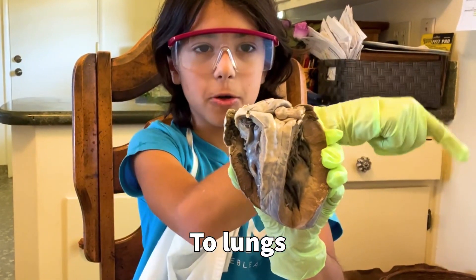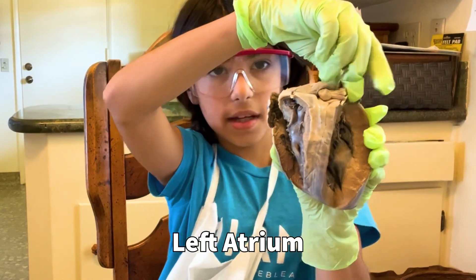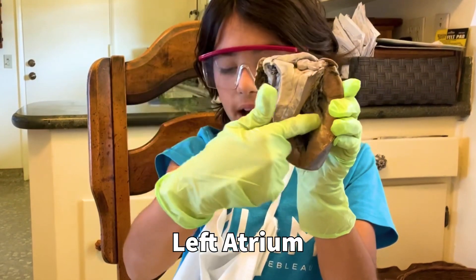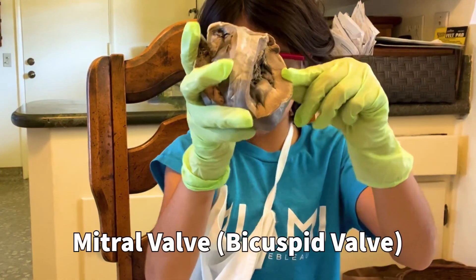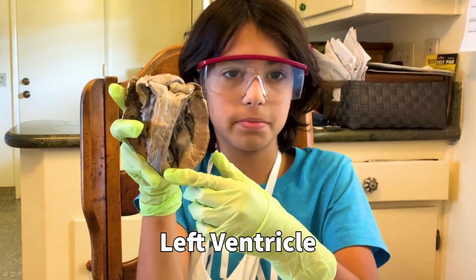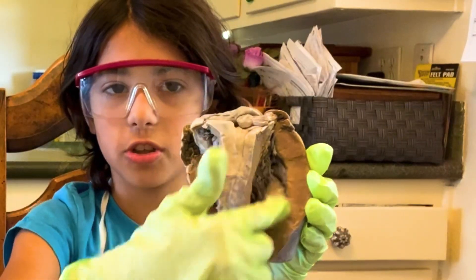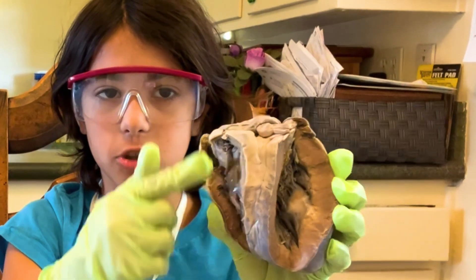Then from the lungs, it goes to the left atrium. Then it comes down to the mitral valve, then it comes down to the left ventricle. And then look at how thick the left ventricle is compared to the right ventricle.